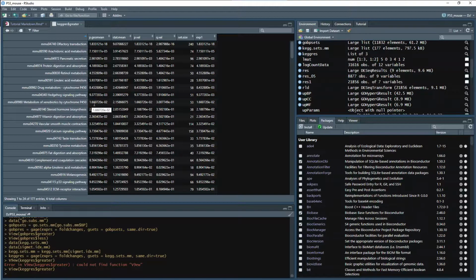So that is going to be something that is attributed to if there is abnormal hedgehog signaling happening. A lot of times that can lead to the proliferation of cancers like pancreatic, lung, etc. Not that that's going to happen here if left unchecked because of the P53, but that is of note. What else do we see in here?